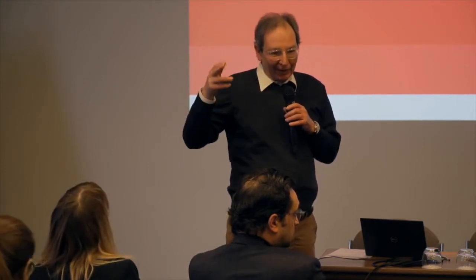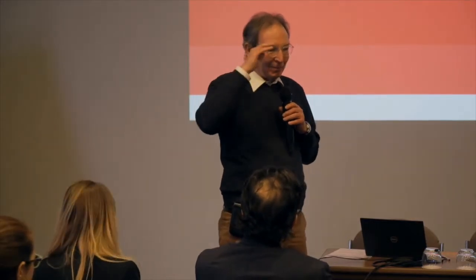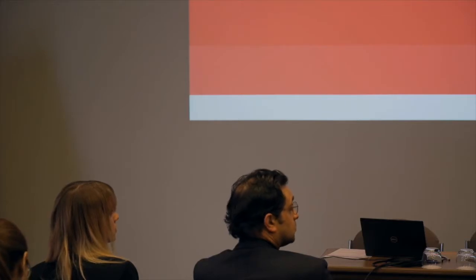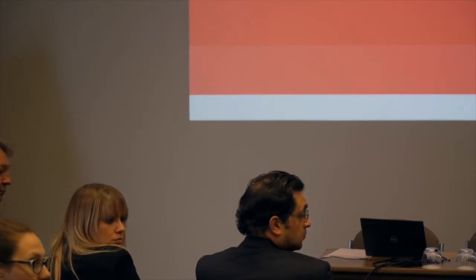On the other hand, looking at some microscopes that I have installed in the hair and fiber particle world, many people work with 20 times objective, 40 times objective. Some people even work with 100 times objective. Here we are talking submicron resolutions. What that calculation was based on, I think, was a 10x objective. That's a mistake of mine, and I think it will be corrected in the specification that you will receive.